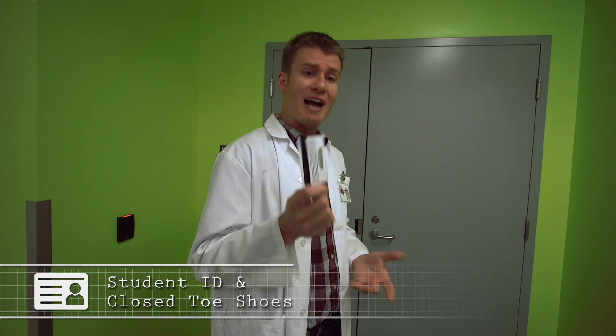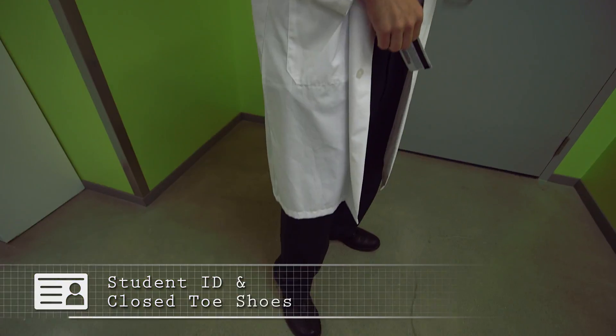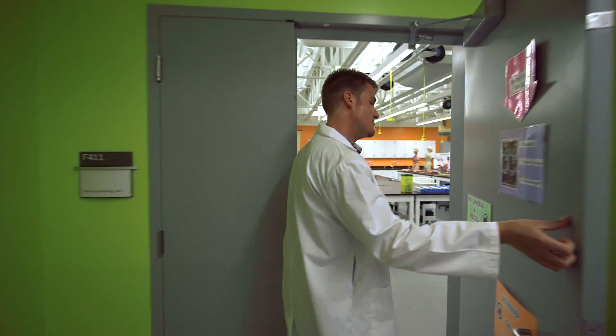I'm also going to need to see your student ID, and I need you to be wearing closed-toed shoes. It's really important that you're on time for lab — students that are late may not be admitted. Remember, no food, drinks, or cell phones are permitted into the lab at any time. Just bring the bare minimum: your lab handout and writing utensils.